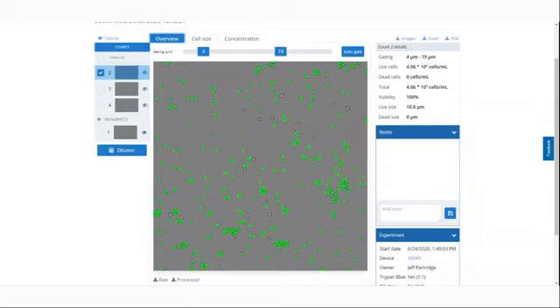So excluding is essentially analogous to if you're doing flow cytometry and you set a threshold, you bin something out. If you exclude it, it's gone from the report. You can still find it here, and then you can say, well, I want to put that back, and then it goes back into the bin. So I'll show you another count actually. So let me stop sharing for a sec.